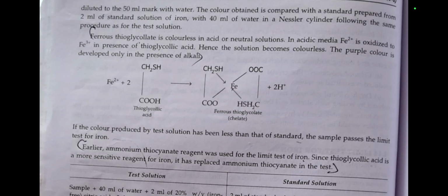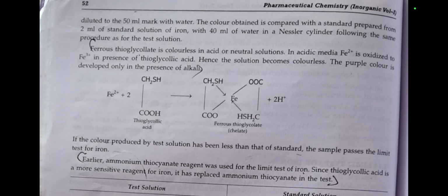So ferrous thioglycolate is colorless in acidic and neutral medium. In acidic medium, ferrous, that means Fe2+, is oxidized to Fe3+ in the presence of thioglycolic acid. Hence, the solution becomes colorless. So the purple color develops only in alkaline medium.